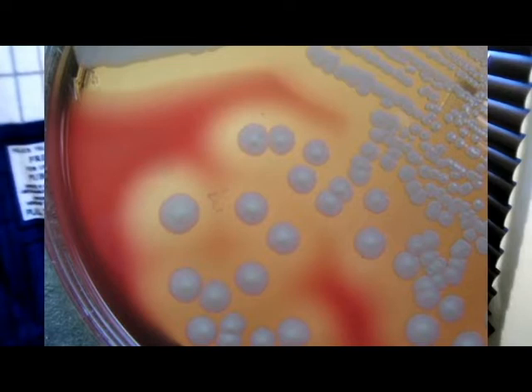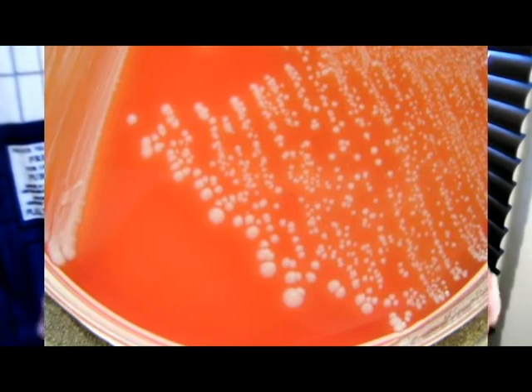They will consume the blood from the blood agar plate. A beta hemolytic, these are able to grow a little larger, and they will also consume the agar on the blood agar plate. A gamma hemolytic or a non-hemolytic. I don't like gamma hemolytic as a name because it implies that it is hemolytic. These non-hemolytic bacteria are not able to lyse the blood, and so you'll just see the bacteria growing on the agar without having changed the color at all.